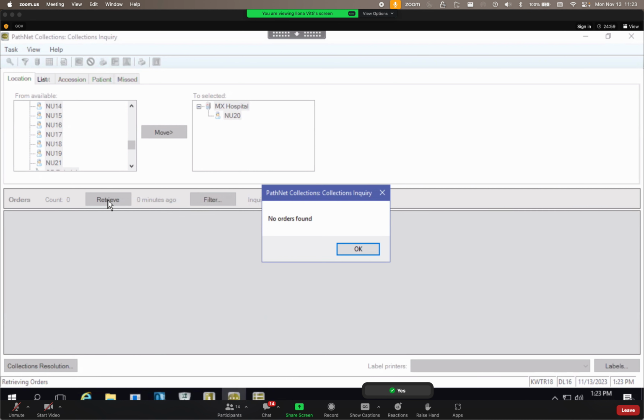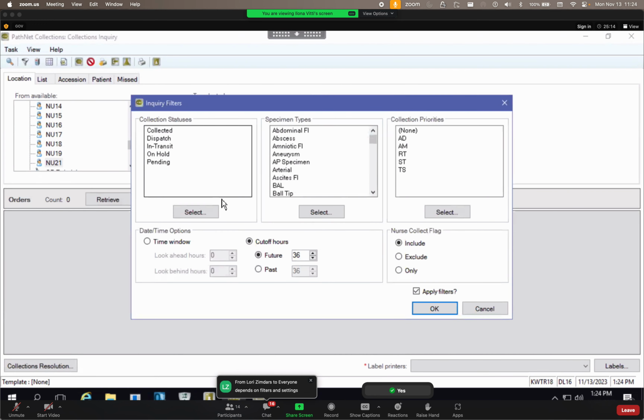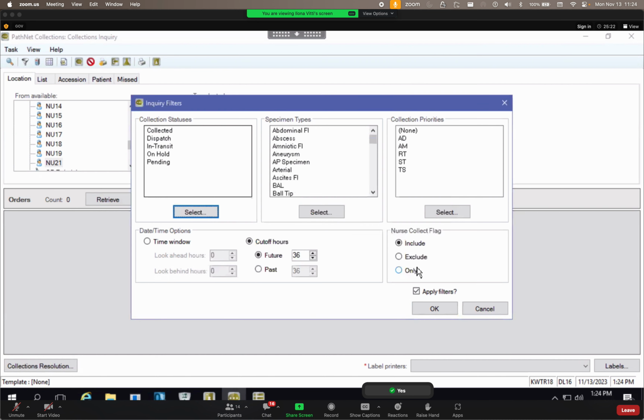And folks, the reason for this is once the orders have achieved an in-lab status, the collections part is done. Now, Lori is saying, hey, go ahead and check the filters. This is still our collection statuses. Here's all of our collection statuses.